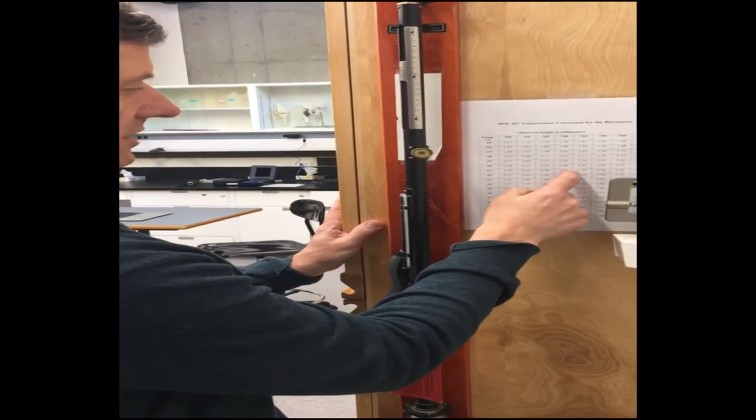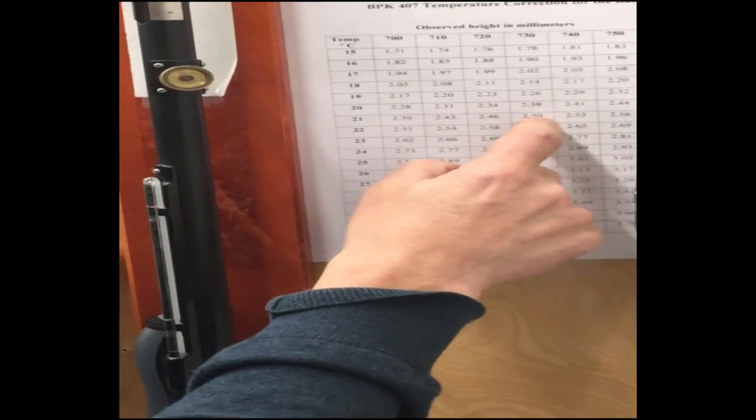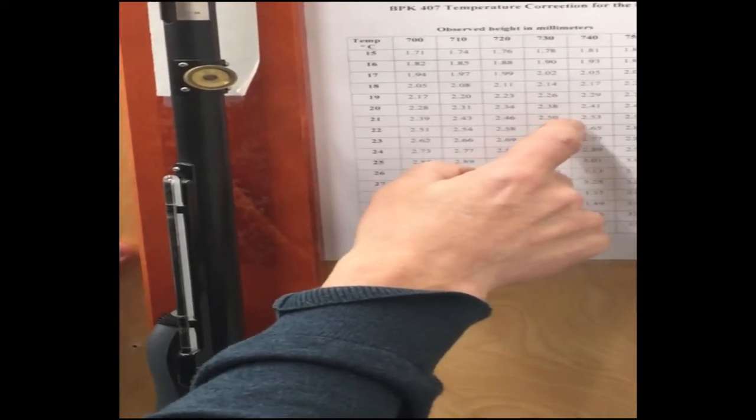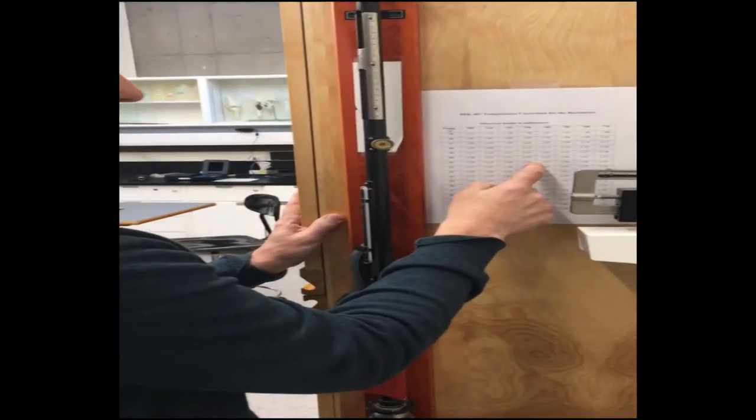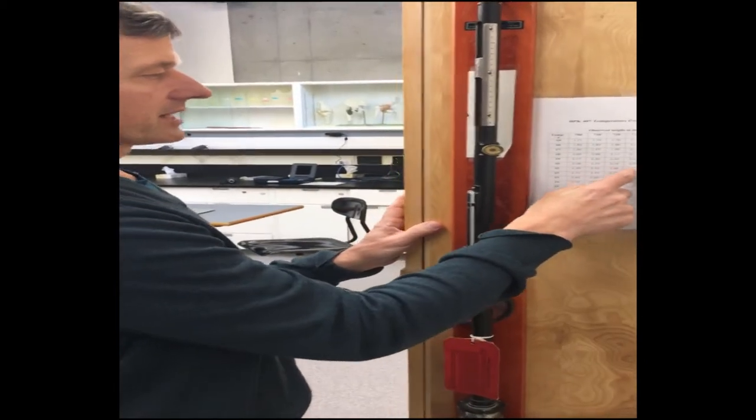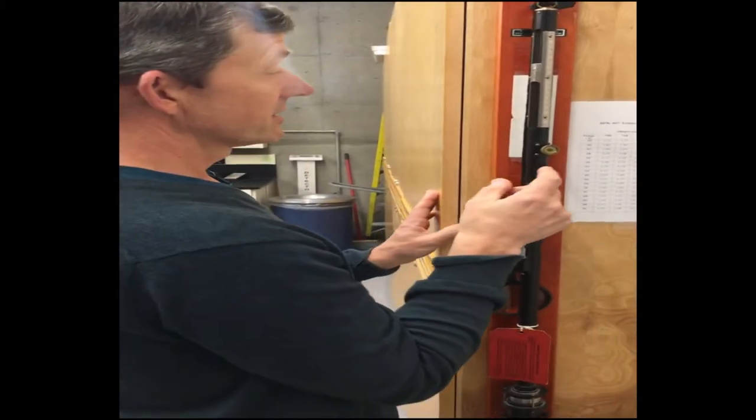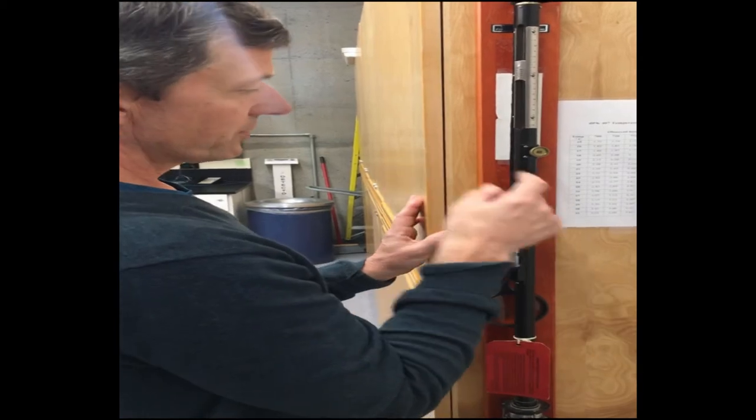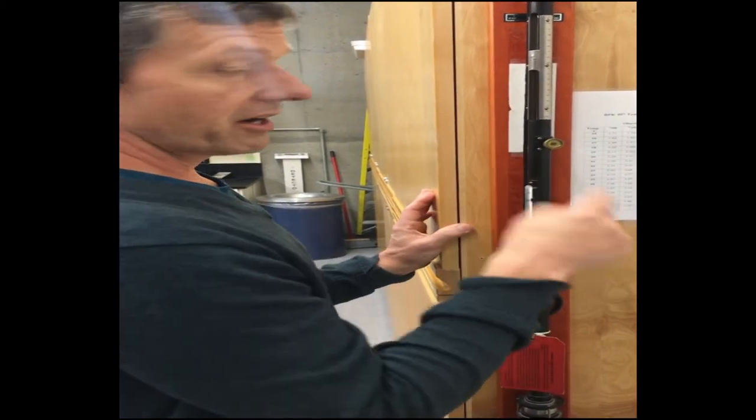We know it's 737 millimeters mercury. If I look at my correction factor, it's probably about 2.52, so I'll say that my correction factor is 2.5. I then take my initial value of 737.3, subtract 2.5 from that, and that is the corrected barometric pressure.